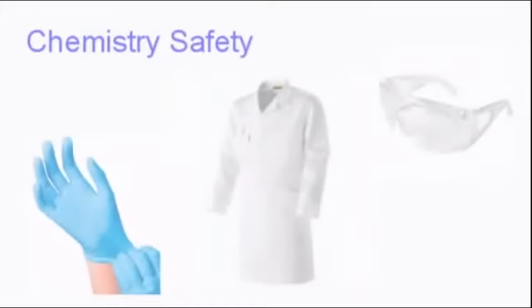Before everything else, let's talk about safety. In a chemistry lab, it is required to wear a lab coat, gloves and eye protection when manipulating chemical compounds. Now we can start.